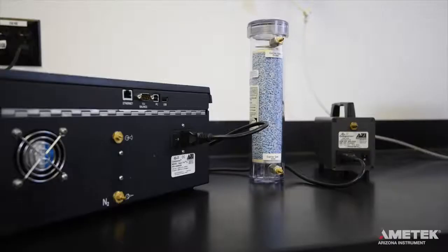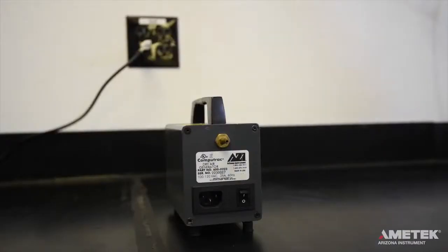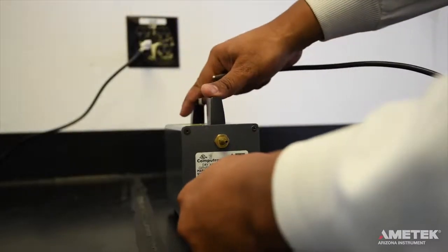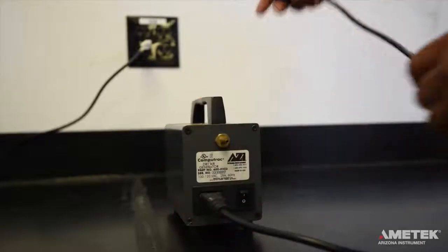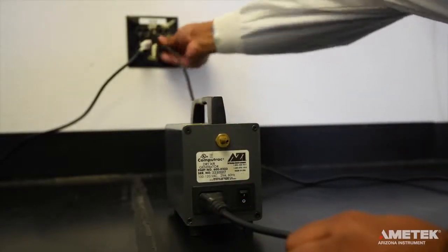If you are not using one of the previously mentioned options, the third option is to use the Ametek Arizona Instrument Dry Air Generator, or DAG for short. For this option, connect the dry air generator to its power cord and plug it in, making sure that the power switch is in the off position.